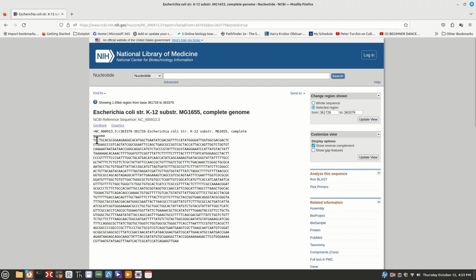We're no longer starting with an ATG. That ATG should be somewhere, let's see, 70, 140. That ATG should be somewhere down here, right here. Right here is your ATG. All right, so we added everything before that onto our sequence. That should be 200 base pair. So we added that 200 to our sequence, and then I added 200 at the end as well. And hopefully that's enough so that you can overlap between Z, Y, and A.